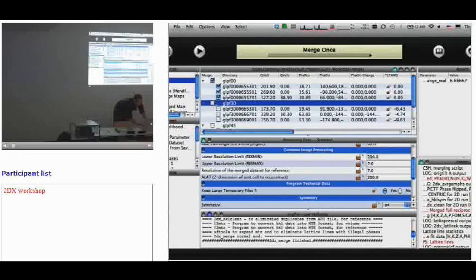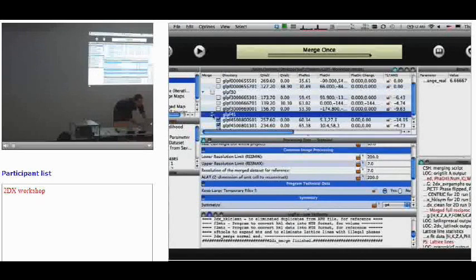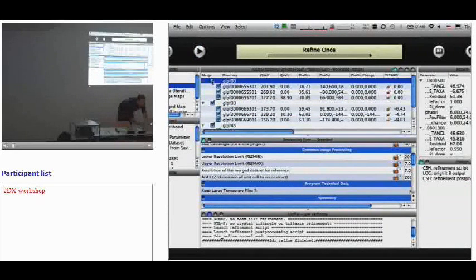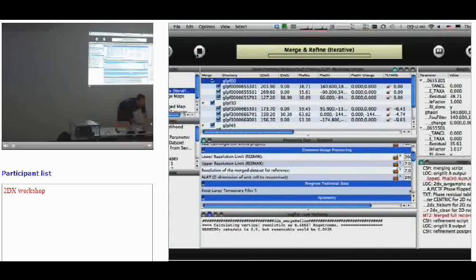So now we have a 3D reference, and so then we don't use these, but then take the 45-degree tilted pictures and align them onto our reference. So you go step by step. And then you can take all of them together, so also 30-degree and 0-degree, and do this in a few rounds.